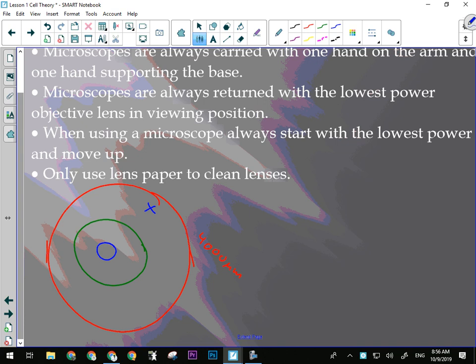So what we have to do as we're looking through the lenses is, once I find what I'm looking for, I'll use those little knobs on the bottom of the stage to move that thing into the center. Because as you look through the microscope, this is kind of funny, you'll actually see a big black thing that points towards the middle. It's called the pointer. It's actually just a small brass wire that's in there and points inward. It's supposed to be there.